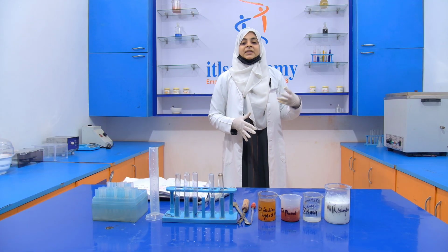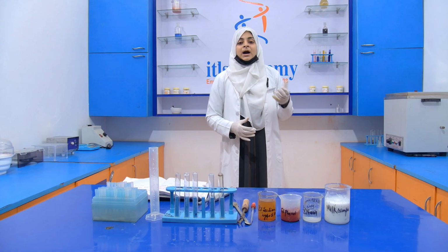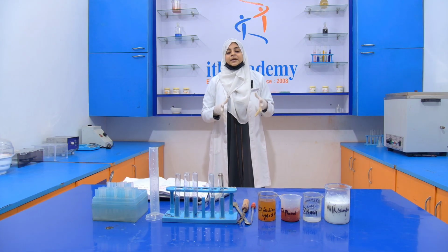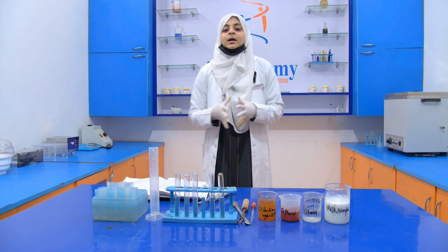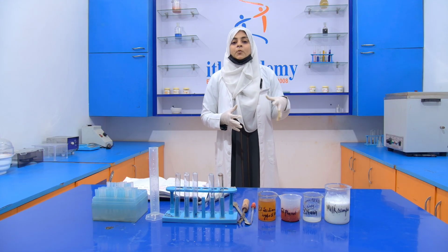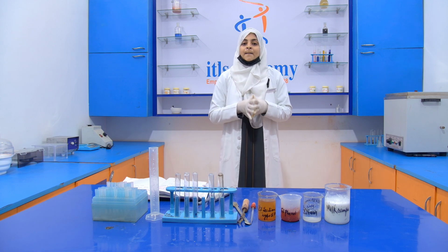Even when ammonium salt is added to the milk, it shows an increased lactometer reading, and it also shows a richer quantity of protein in the milk.